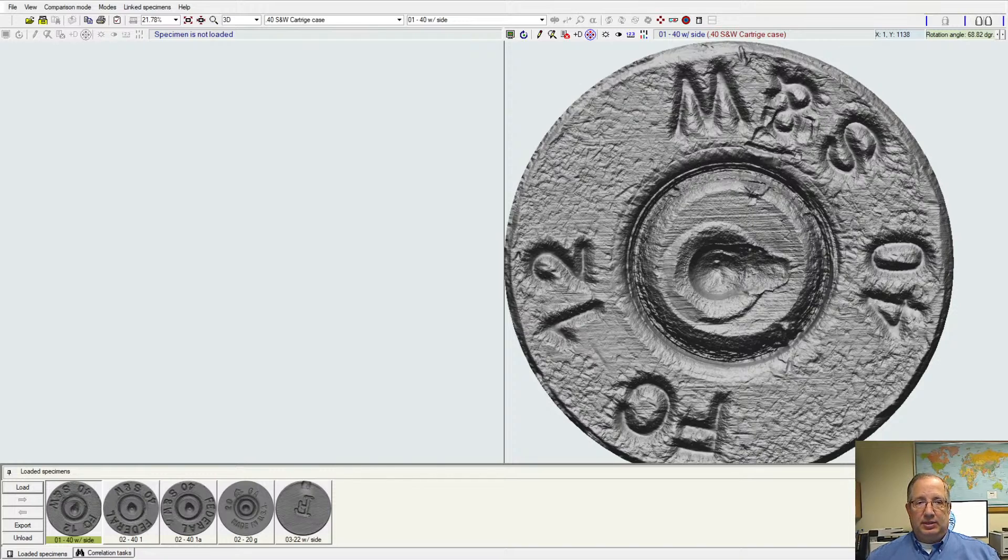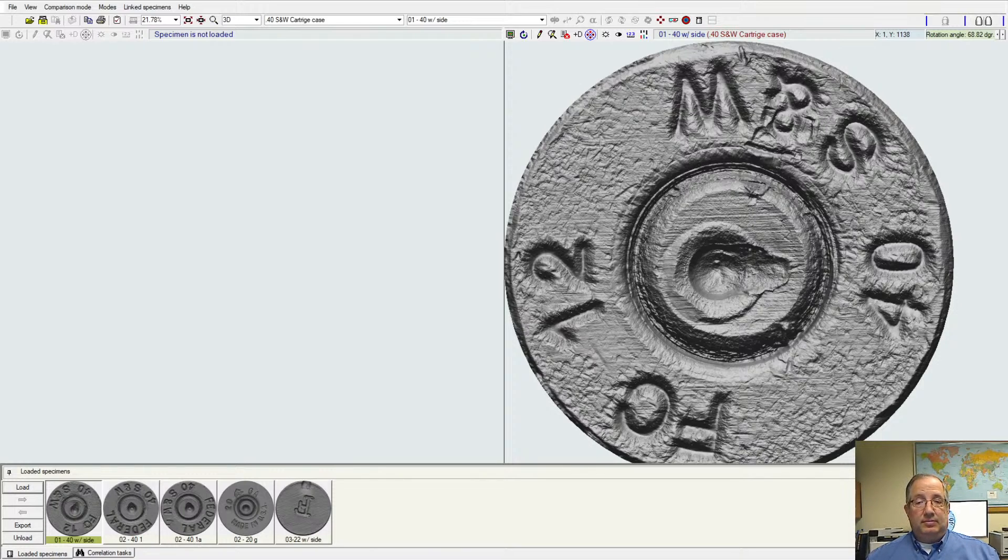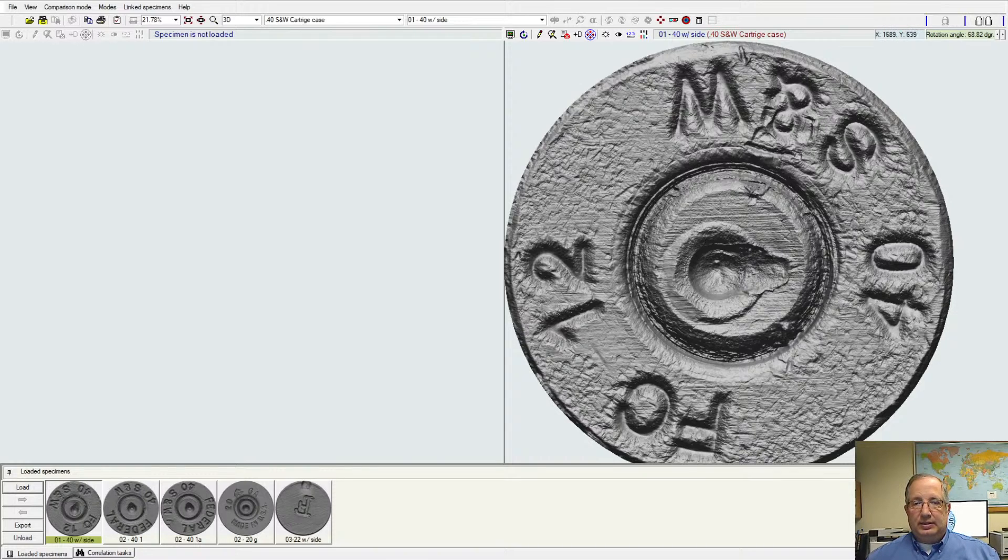Now what I'm looking at here on my screen to start off with, we have a cartridge case that's been loaded. This is a .40 caliber Smith & Wesson that's been fired already from a weapon. The system has scanned the sample and put it into the database, so now we can actually see that three-dimensional representation on the screen.